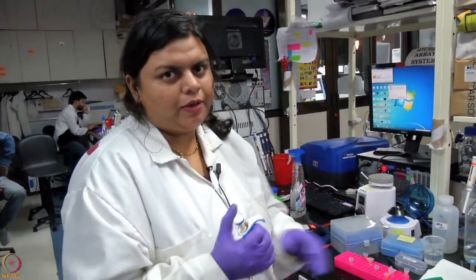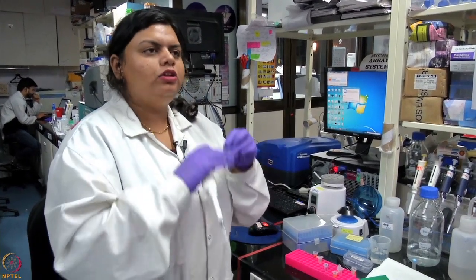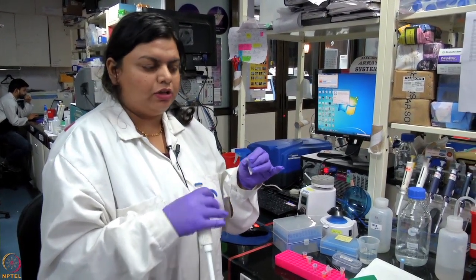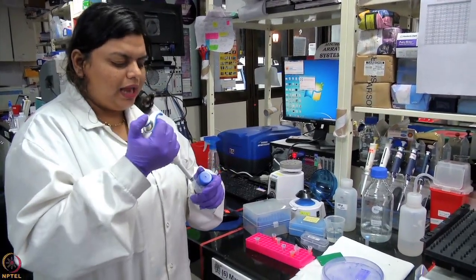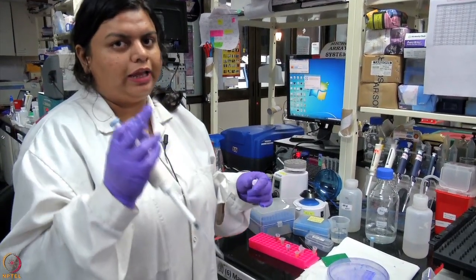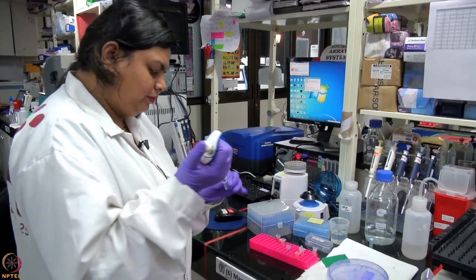Why do we have to do washing? Because if you want to reduce the background, that is, if you consider this mixture, it has lots of proteins which are also binding to the antibody bead conjugate, which could be not very strong interactors of your protein. So the moment we add buffer, we'll give it a gentle mix. All these loosely bound proteins will get washed away. Usually we perform a washing for two to five times. Again, depending on the protein of your interest and the specificity of the antibody, you can optimize these parameters.